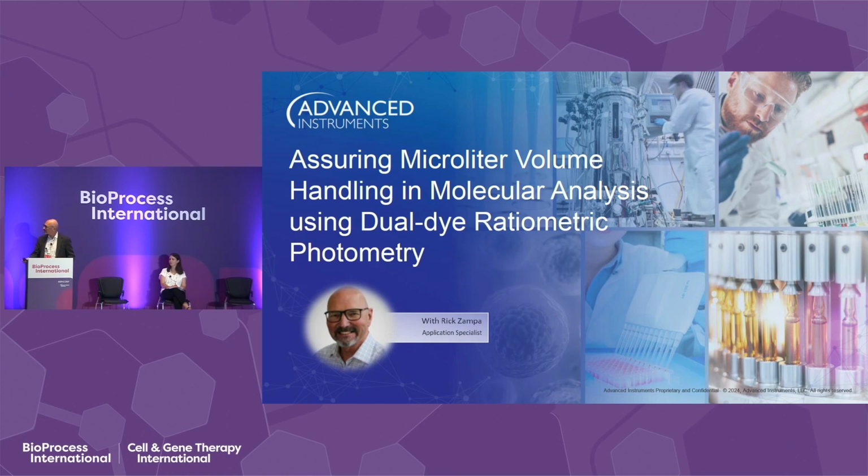We're going to go through assuring microliter volume handling and molecular analysis using dual dye ratiometric photometry. We're going to be discussing how to optimize your automated liquid handler for the best outcomes in your PCR-based assays with dual dye ratiometric photometry.